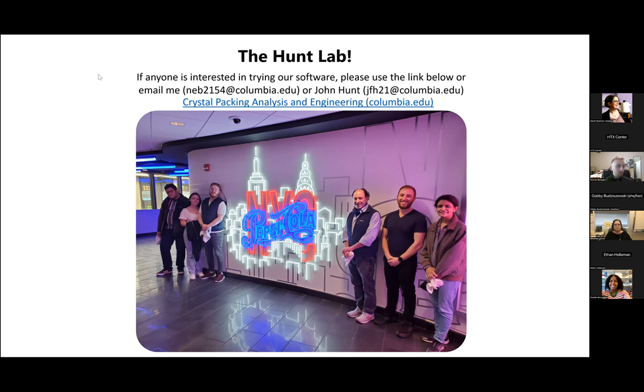crystallization propensity to a limit, only because if you are introducing favorable conditions for the protein to crystallize, and then you introduce the protein that doesn't like to crystallize into it, I think that'll make it difficult. So to answer your question, yes. And if your protein is only on the fence about crystallizing, but if it's super recalcitrant, I'd still try it for fun, right? I could be totally wrong. But I think it may do more harm than good, but you wouldn't know until you tried. Again, great point. Oh my God.